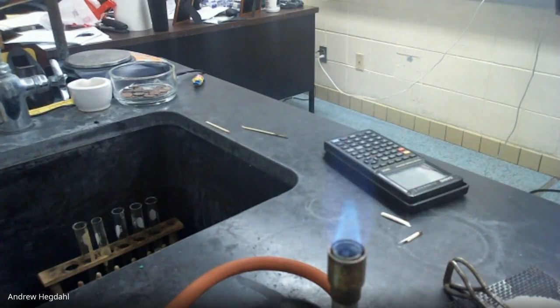Remember, turning the barrel changes the color and temperature of the flame. Yep, so if you look at the bottom, you see like a brown. Okay, and then we want our flame about 2 to 3 inches tall, two distinct cones. We change the height by changing the amount of gas it's getting. We change the color by changing the amount of oxygen it's getting by turning the barrel.